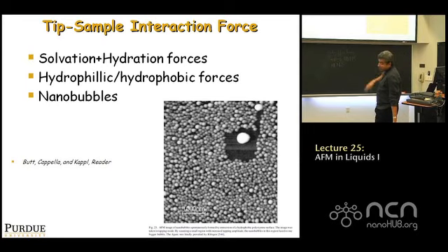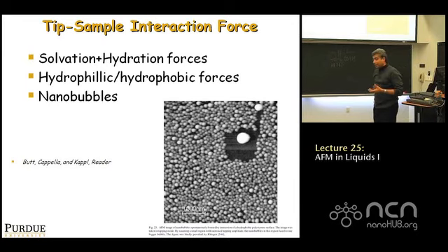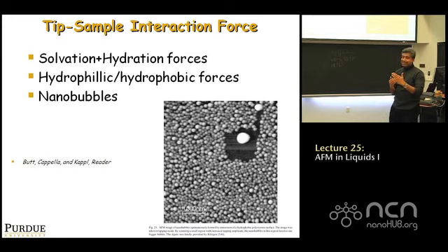Besides that, you have hydrophilic and hydrophobic interactions. That's different. This has to do fundamentally with chemical interactions, okay? So, for example, if you have a hydrophobic surface and a hydrophobic tip in liquids, what that means is the tip does not want to have water around it, and the surface doesn't want to have water around it, but you've immersed it in water.